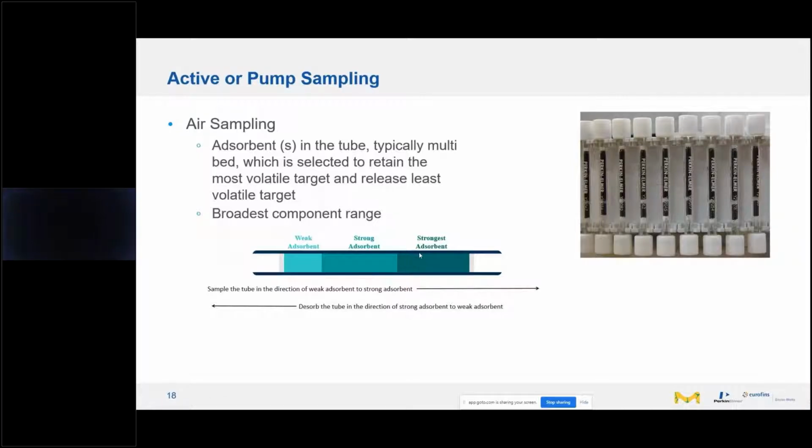Now, when we desorb, when the instrument desorbs, we put the tube into the sample carousel, so the flow is in the opposite direction as it's being heated, because we do not want to force the high molecular weight or high boiling point components into the strongest absorbent. This optimizes recovery, and that is why it's so important to use a recipe like the one Jamie designed, to optimize this retention and desorption and recovery to get accurate results as well.